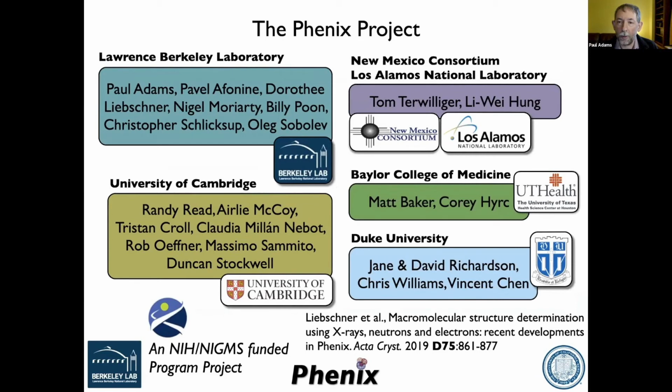In this special instance, the atom displacement factors in the PDB should match what I'm expecting in the cryo-EM map. So I think I wouldn't need to change them, but if I had, say, a PDB from another structure, would I then change the atom displacement factors to a certain value?